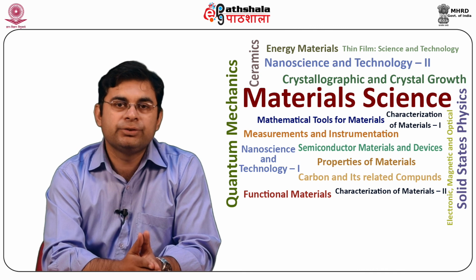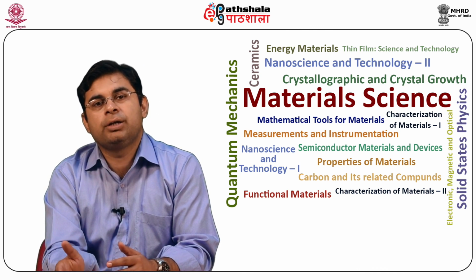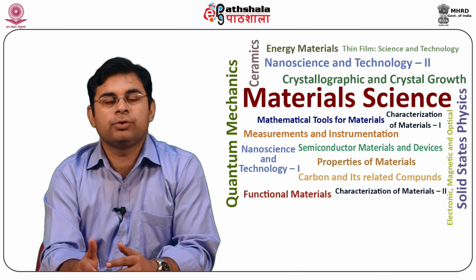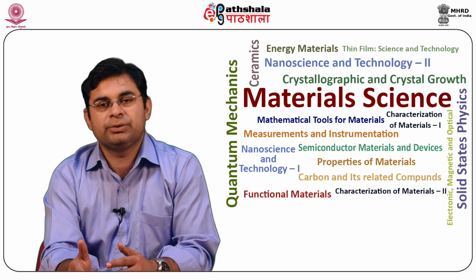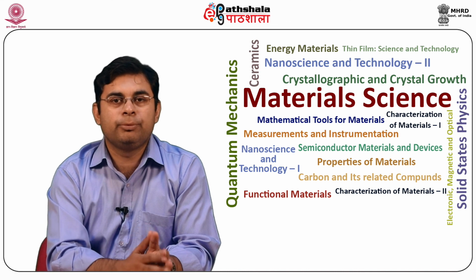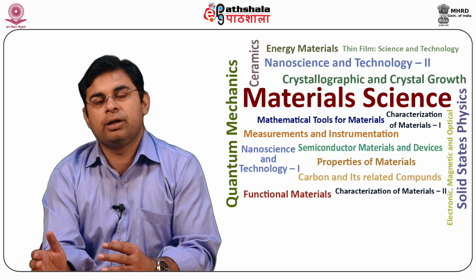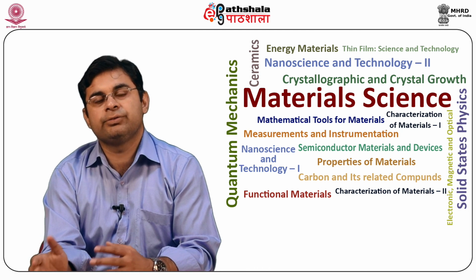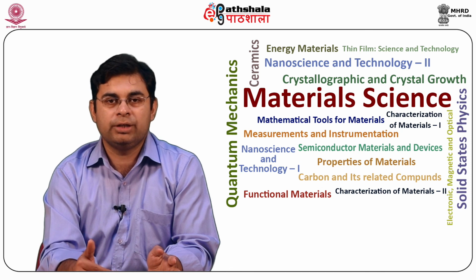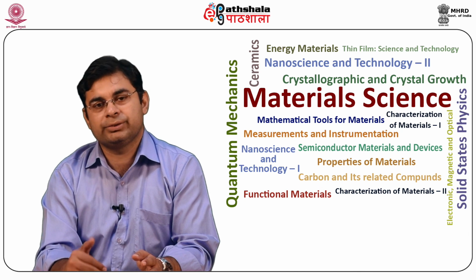The advantages of tapping mode are the elimination of a large part of permanent shearing forces and less damage to the sample surface, even with stiffer probes. Different components of the sample, which exhibit differences in adhesive and mechanical properties, will show a phase contrast and therefore even allow a compositional analysis.